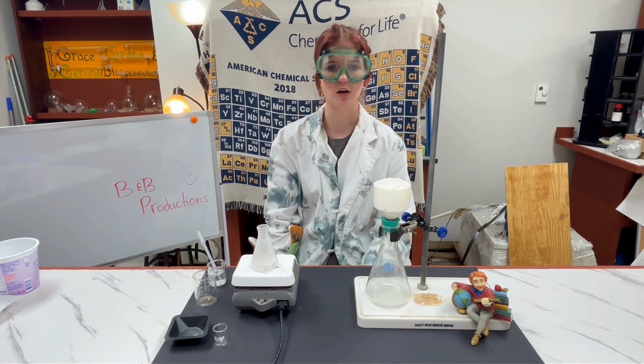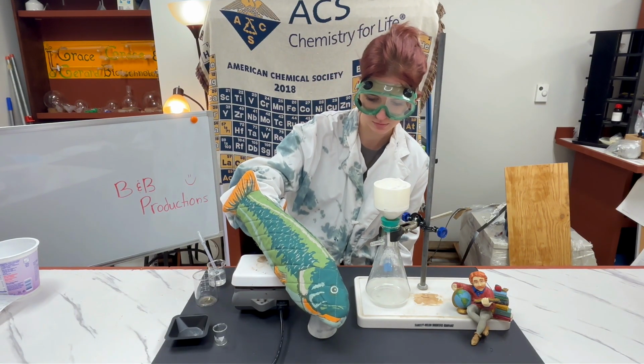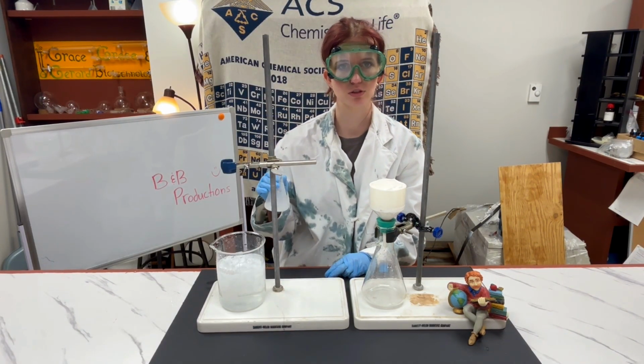After it is fully dissolved, remove the flask from the hot plate and allow it to cool to room temperature. Once the flask has reached room temperature, place the flask into an ice bath until crystals are fully formed.